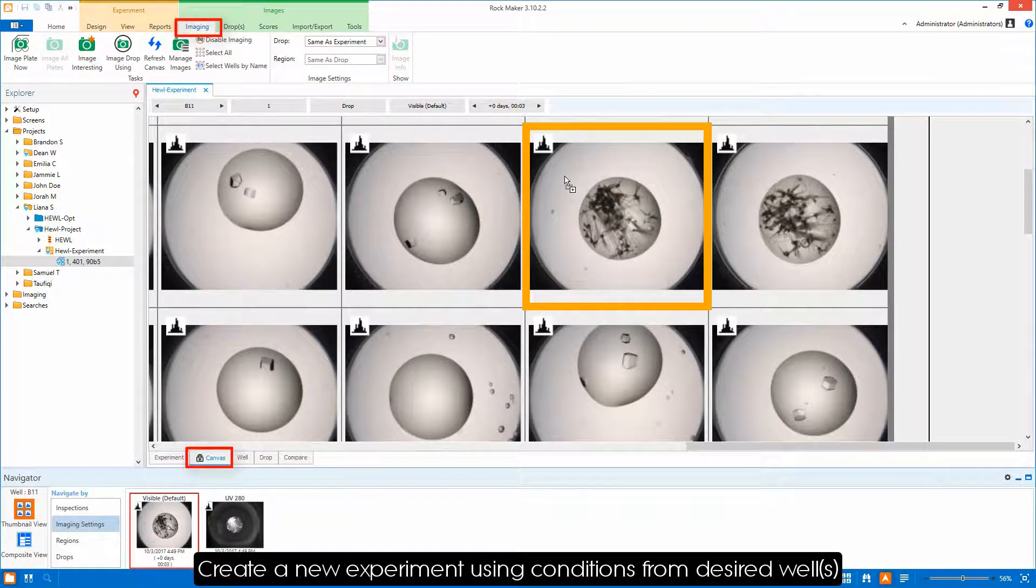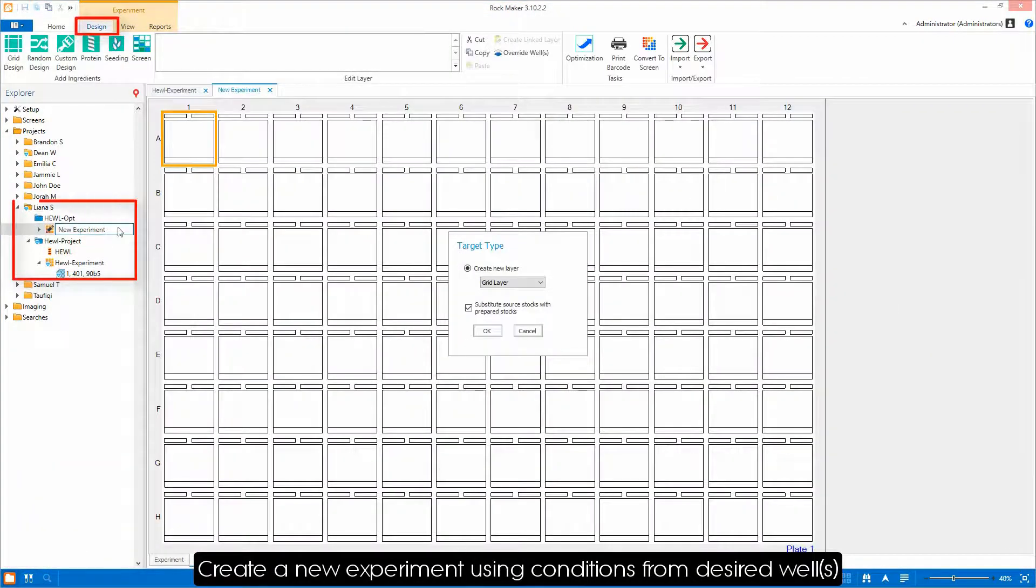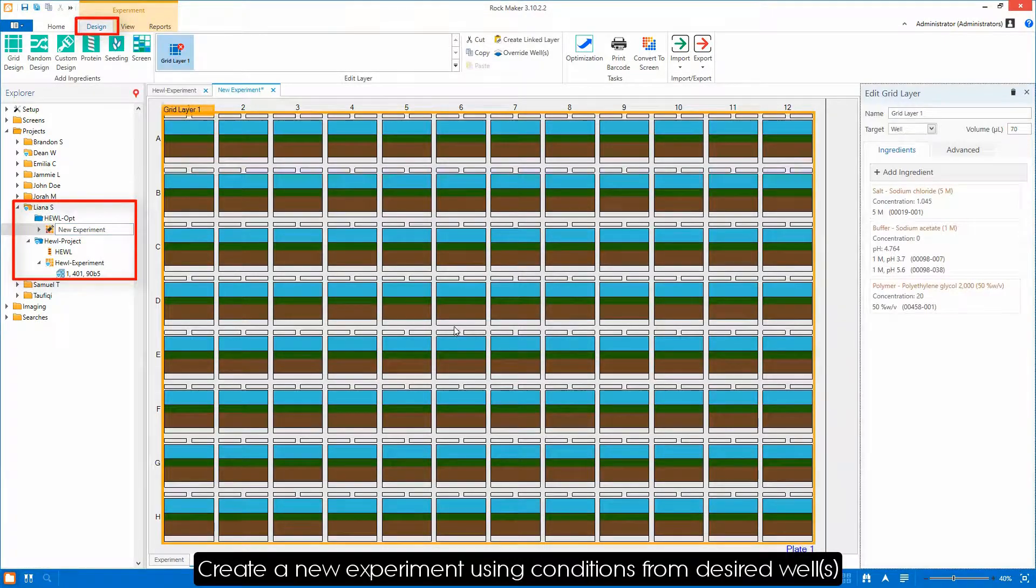Simply drag and drop the well you want to use into your project folder to create a new experiment using this well's conditions.